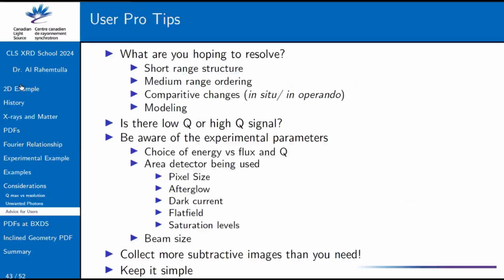The other thing that's helpful for you to know is if your sample possibly has low angle scattering. This would usually be if you have any large crystal lattices in structures like that. I think Bob even mentioned one of those really long powder diffraction unit cells where one of the peaks got captured by the beam stop. When we shrink everything down in size and make everything tight, especially with higher energies, that's very likely to happen. And losing a peak when you're trying to do a Fourier transform can be very bad.